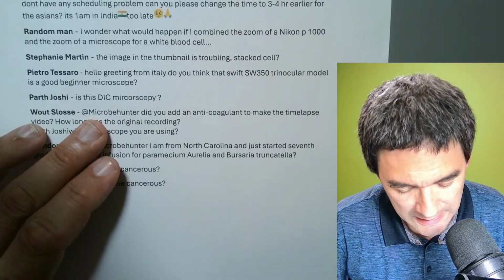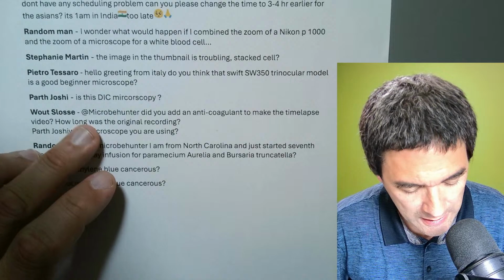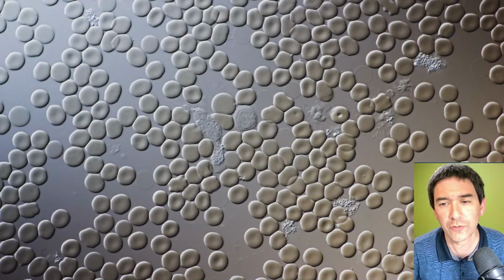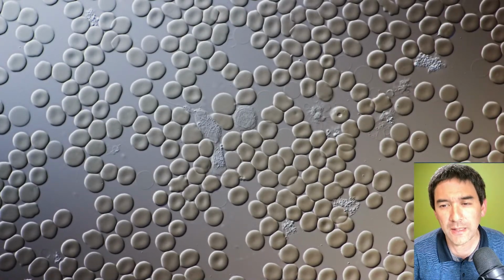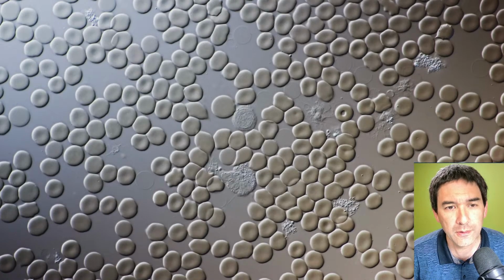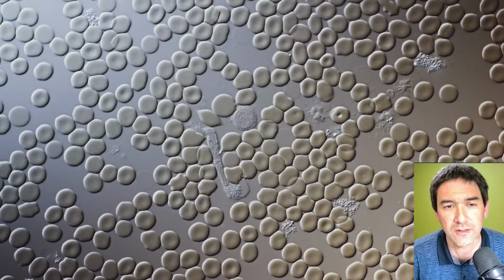Did you add an anticoagulant to make the time-lapse video? No, I did not. How long was the original recording? Okay, the original recording was several minutes long. I'll just show it to you. This is actually the original recording, not in time-lapse, and it says here 7 minutes, 48 seconds. Look, I can actually speed it up. There's this little thing that I can drag, which you're not able to see, right? So it's 7 minutes.